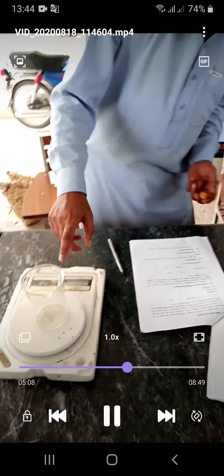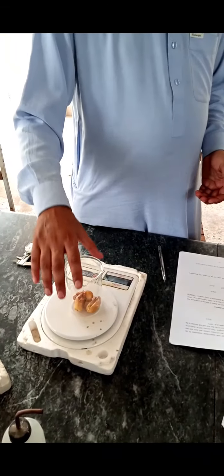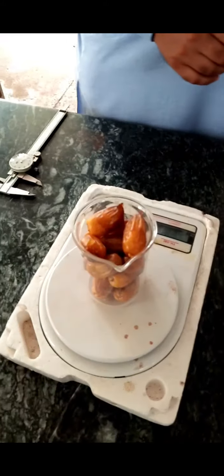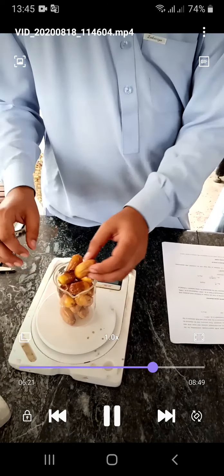This is how we can find the density of the fruit and vegetable. Now we will find the bulk density. For bulk density, we will measure the beaker first, then we will fill it up to the top. The volume of the beaker is 300 ml and we will fill it up to the top and then weigh it again. The difference in the weights will be the weight of the dates. It is now 282. So we will weigh it once again and record the volume.